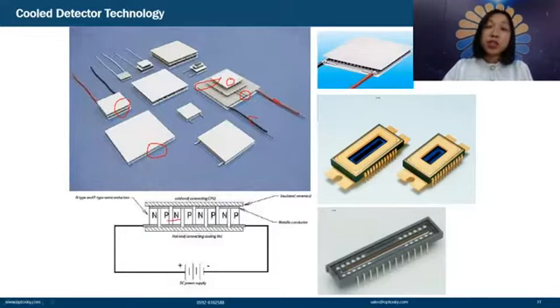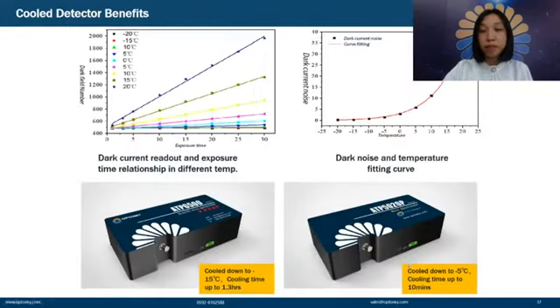So it can just transfer from here to here. And also this one is the high-end detector because it uses the metal platform. And this is because this one cannot generate so much heat, so we don't need to use metal. We can use the CMOS, and we can use plastic housings.